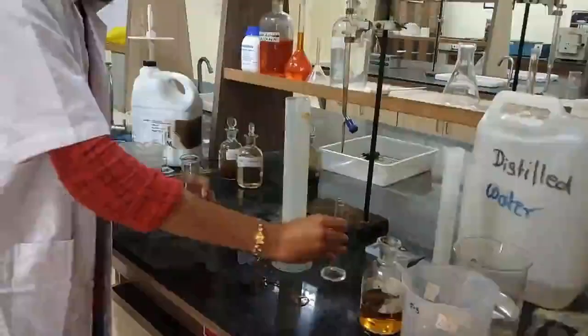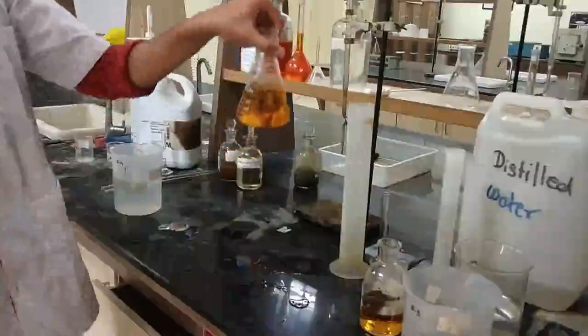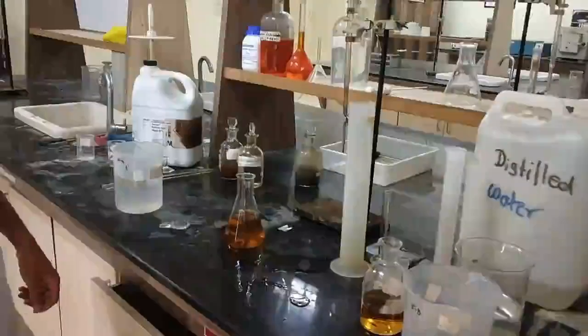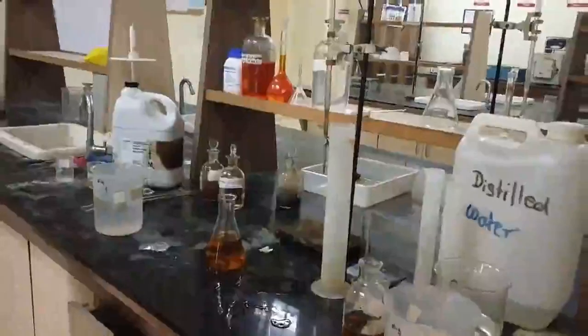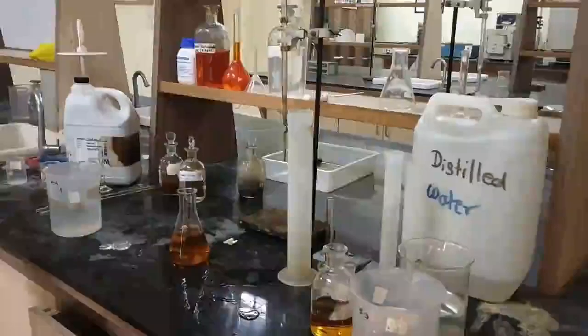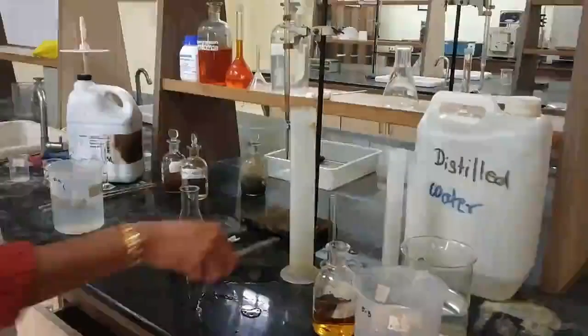We have got 203 ml of sample for the determination of DO. Now this is the oxidized DO sample that we have got. The iodine is liberated, and now we are going to measure this iodine with the help of the titration process. So the next step is addition of 1 to 2 ml of starch indicator.